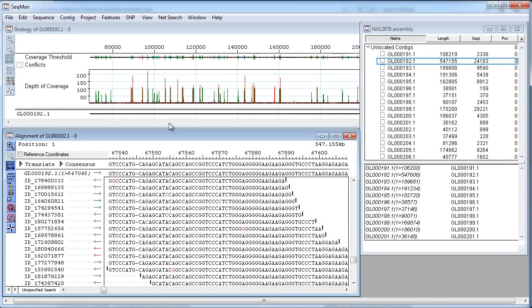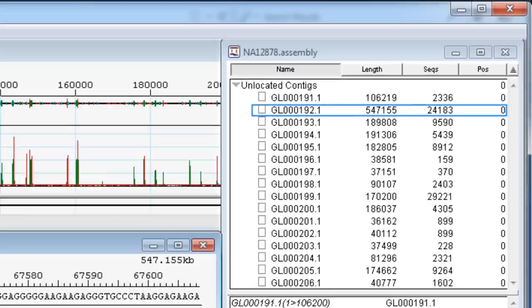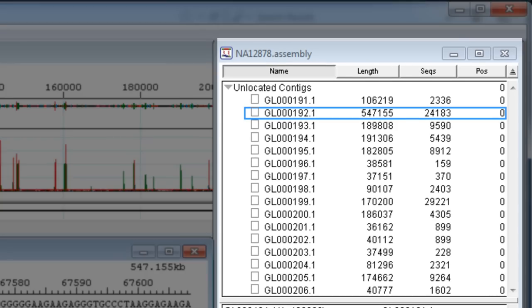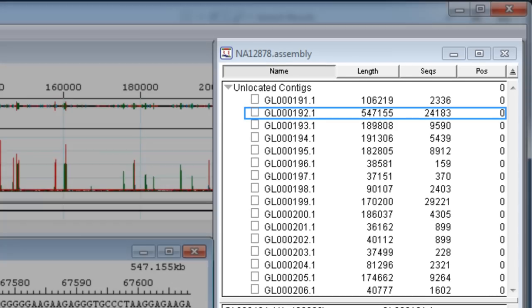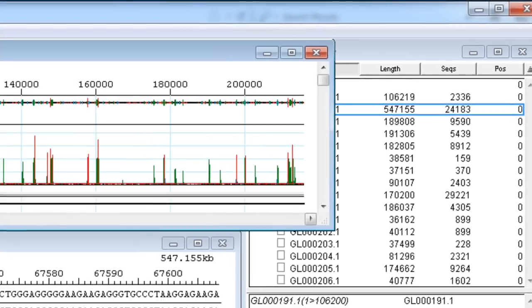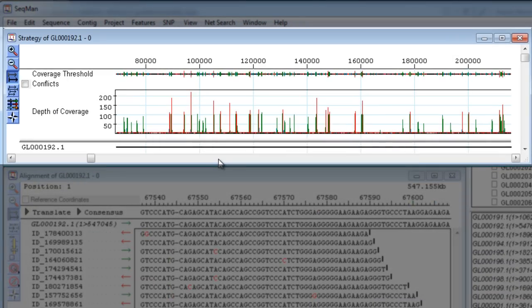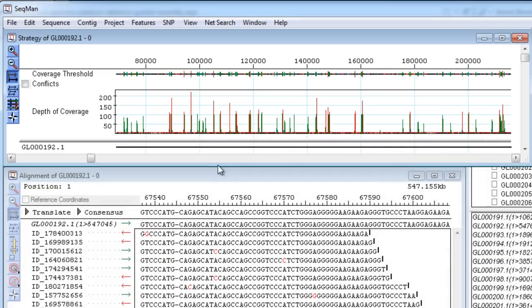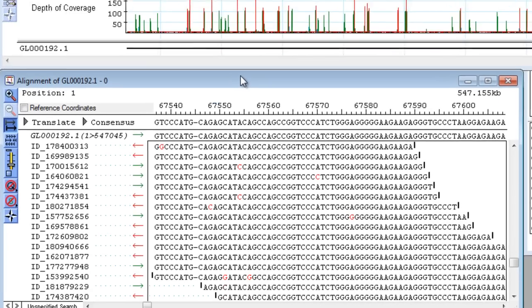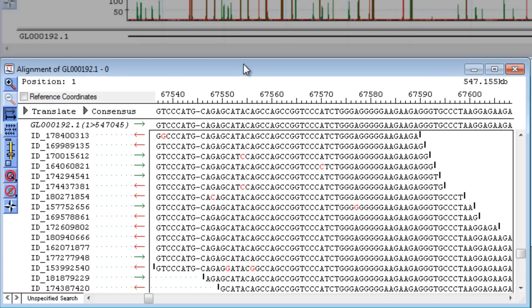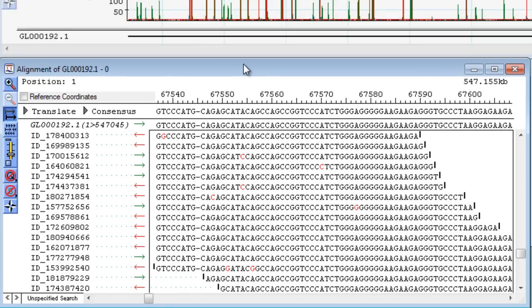When your assembly is complete, you can view your contigs in several different ways: at a high level from the Summary view, as a graphical representation in the Strategy view, or at the Nucleotide level from the Alignment view.